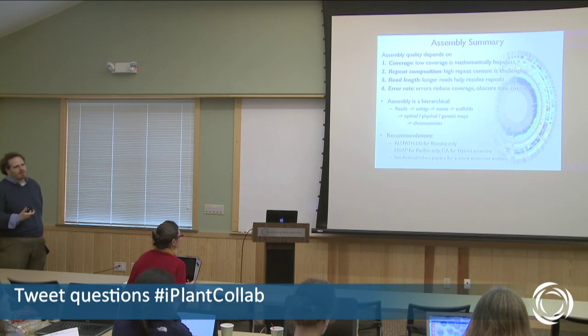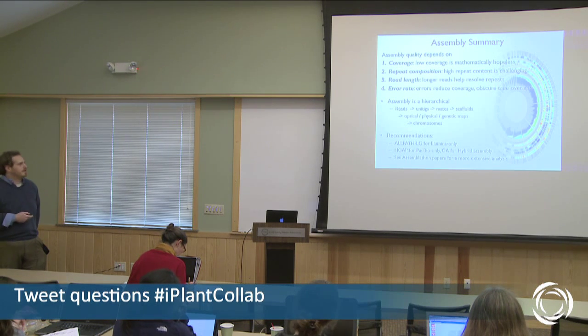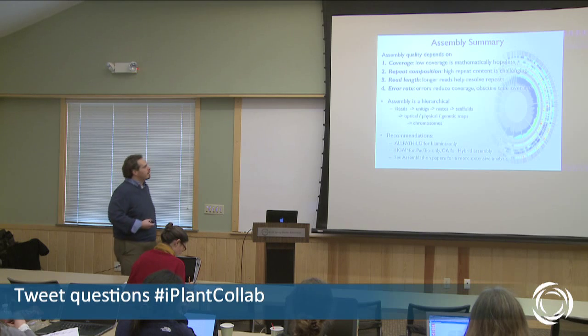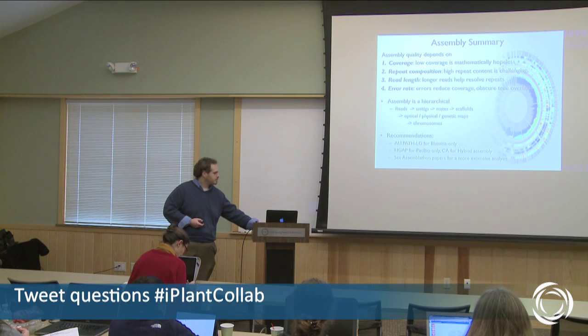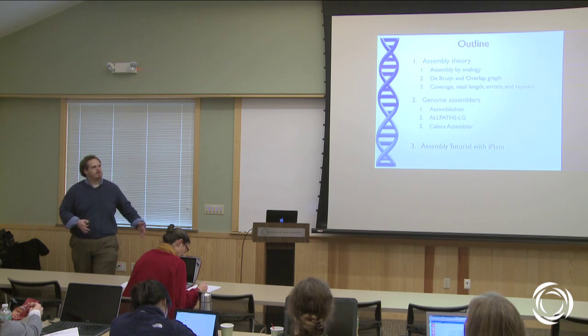If you're sequencing a few megabase pair microbe, they have an algorithm called HGAP that's highly tuned to use just PacBio data. If it's a bigger genome or it's a combination of data, then Celera Assembler is your best approach. And then I strongly encourage you to check out the Assemblathon papers to draw your own conclusions over which assemblers to use. Okay, so that was my whirlwind tour through the available technologies.